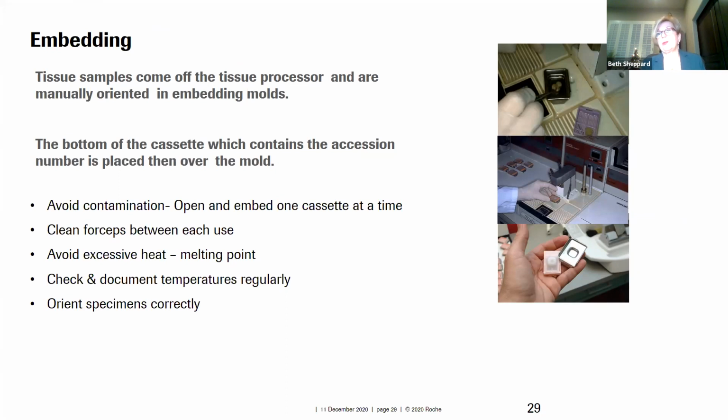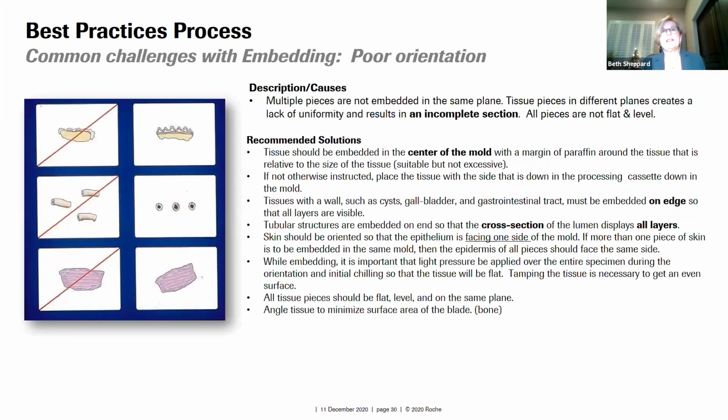orient the specimen appropriately. On part 2 of this lecture, that will happen after a break, we'll talk about the fact that you should not have the chamber go from dry paraffin to the holding tank before you embed. You should make sure that your holding tank actually has paraffin in it, and melted paraffin. So orientation is just as important. You can miss a whole sample by poor orientation.